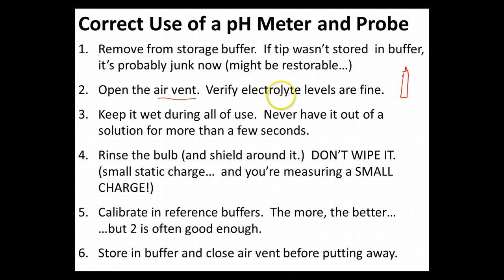You want to make sure your electrolyte levels are also fine at this point. Remember that there are two electrodes in there, so the levels may not be the same — the inside layer may be deeper down than the outside layer — but the key thing is they do have to be full enough. Usually, if you need to put more electrolyte in, you just put it in through that same hole as the plug.